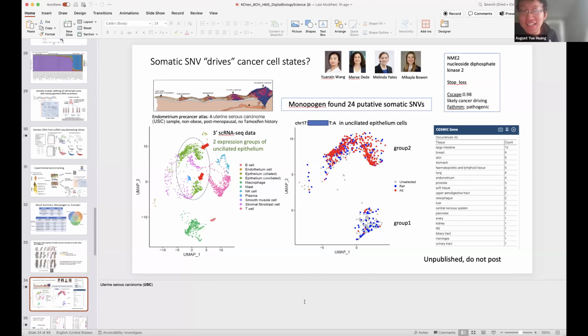But that's also a good check question. You can also check the mutational spectrum to see whether it looks similar to the whole exome or whole genome identified mutations. That's another way to benchmark the performance. Yeah, because we tried some brain single cell RNA-seq data using SComatic, but it doesn't work. The mutational spectrum doesn't look correct, and the mutation burden is also much higher than expected. So we are eager to see if there is any other tool like yours that could work on those samples. That's a great suggestion. Maybe we can try offline. If we have some questions, we can connect with you as well. We haven't done much of that level of QC, but it sounds like a great idea.